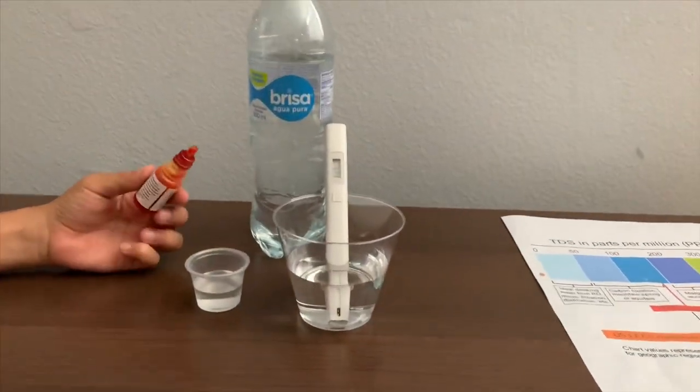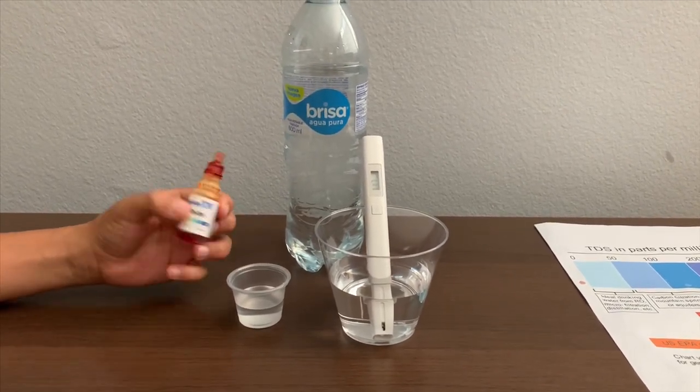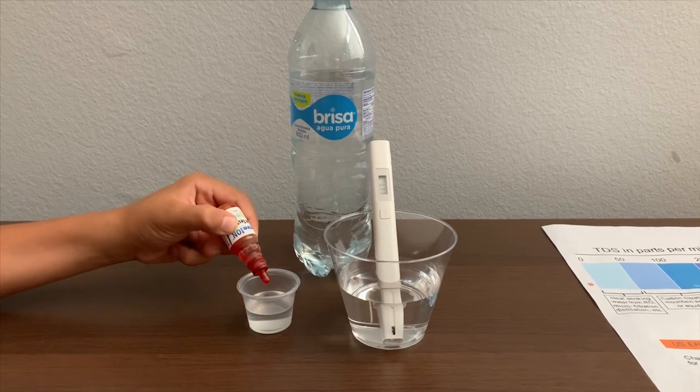Now let's test the pH level. If you want to buy this pH tester, check the link down below. Only do two drops.